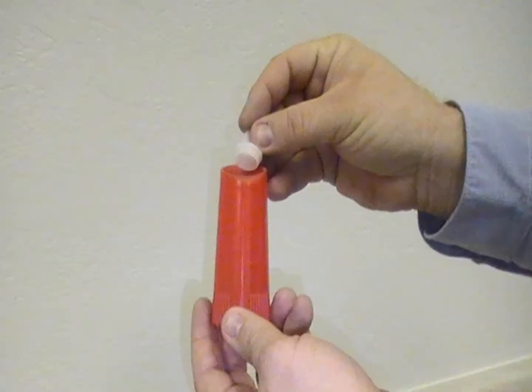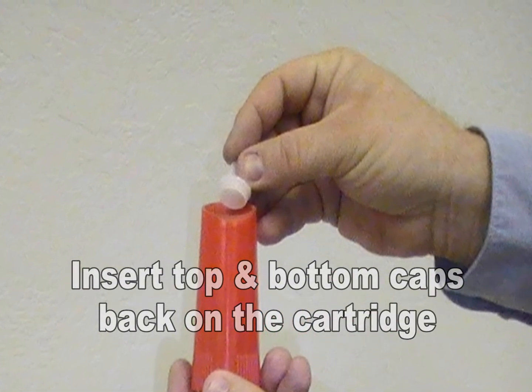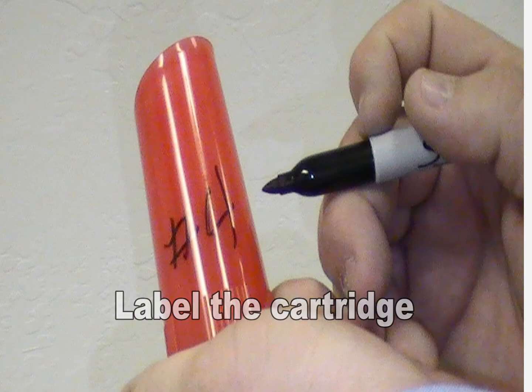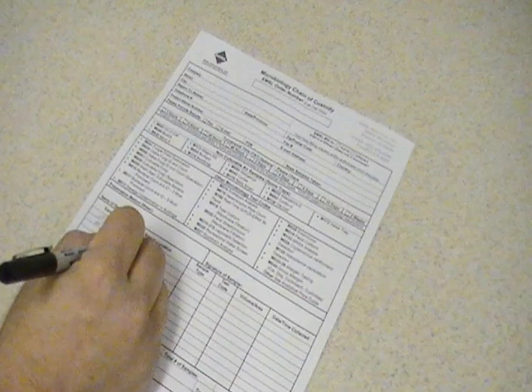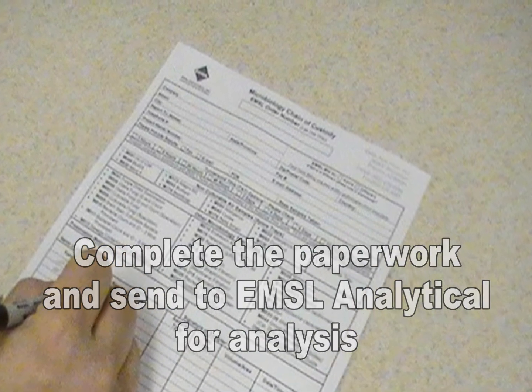After the proper amount of sample material is collected, insert the top and bottom caps back on the sampling cartridge. Then mark the cartridge with the corresponding number on the chain of custody and place the cartridge in a clean ziplock-style bag and send it to EMSL Analytical for analysis.